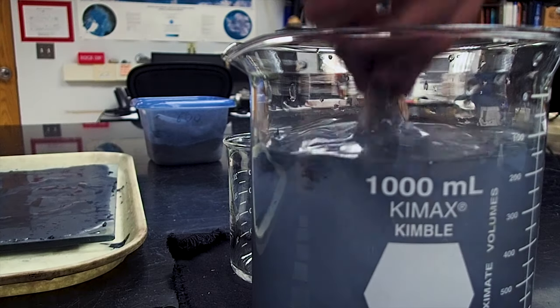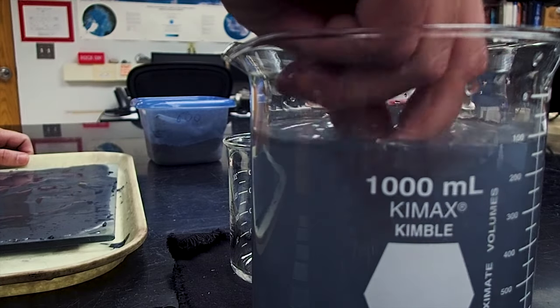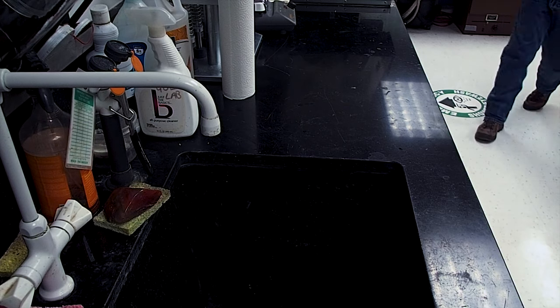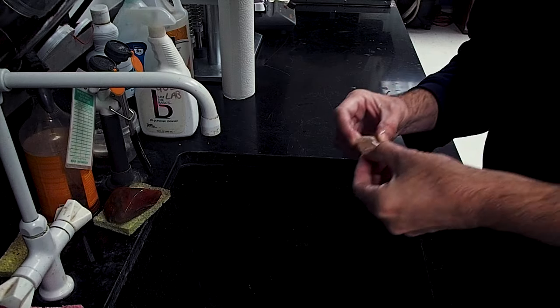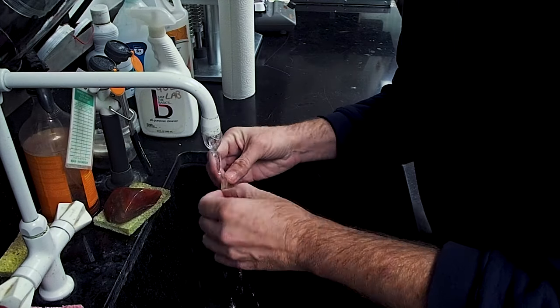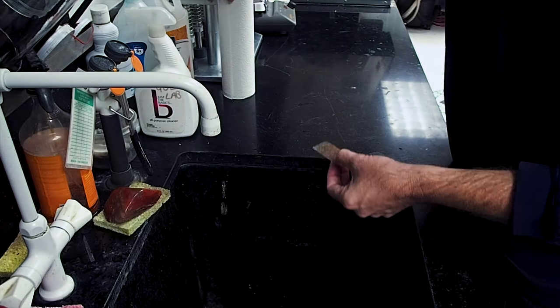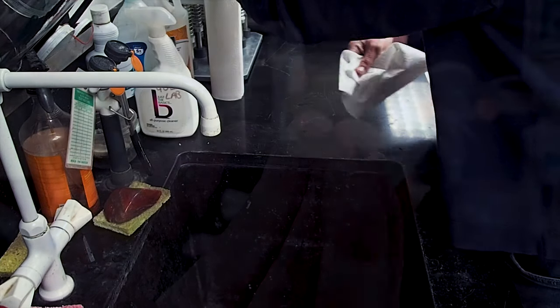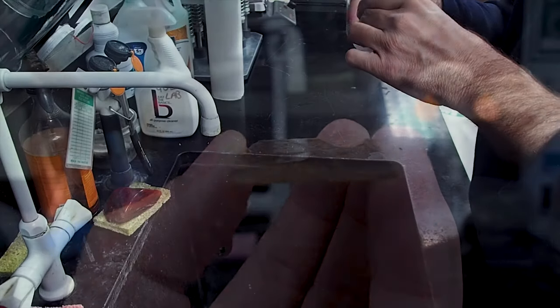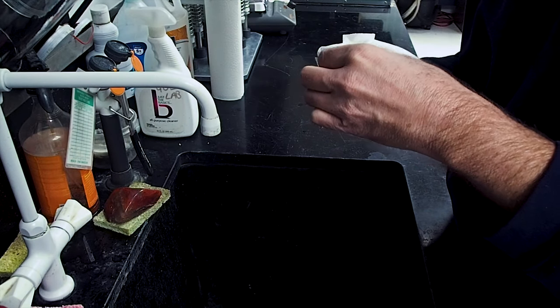When you are ready to check your thin section beneath the microscope, carefully pull the slide from the glass plate and rinse it off. A beaker of water kept nearby is handy for performing an initial rinse to remove most of the grit, but you should perform a more thorough rinsing to remove all of the grit before placing it on the microscope stage. Keep a bead of water on top of the sample, as this will serve as a temporary proxy for an eventual cover slip, but you may want to wipe off and dry the bottom of the slide.